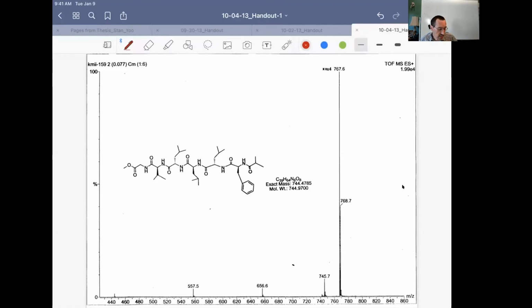All right, so this is an example of a peptide. And I think where I want to start, for starters maybe, is you're probably used to the idea of the molecular weight. And that's the composite weight. Your carbon is 1.1% C13 as well as 98.9% C12.